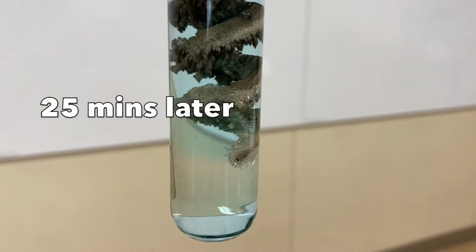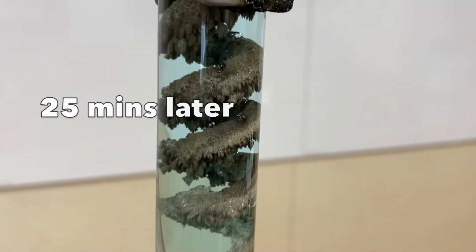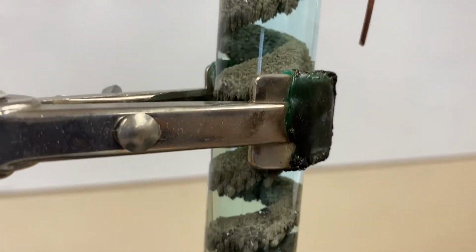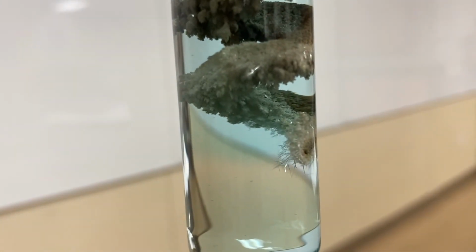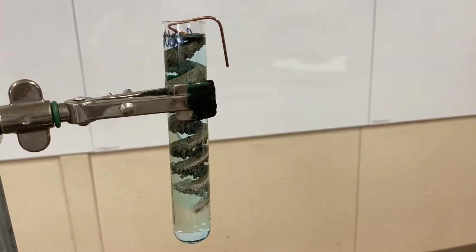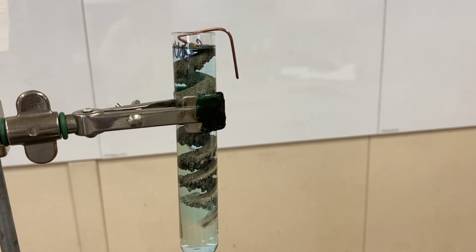Here's an update for anyone who's made it this long in the video. Look at that. Look at that. That's our copper wire. It's getting crazy. So that's what it looks like right now. It's mossy. I love it.